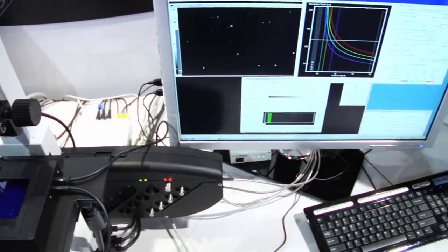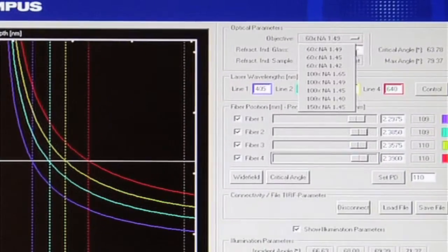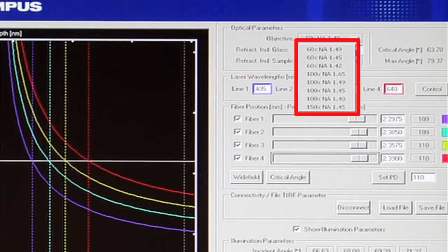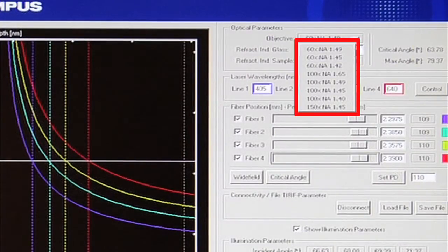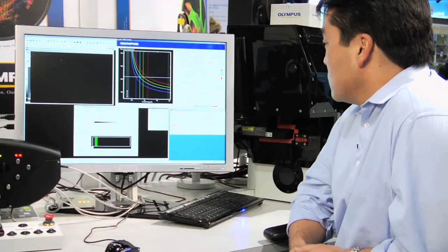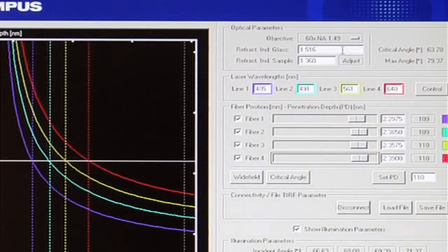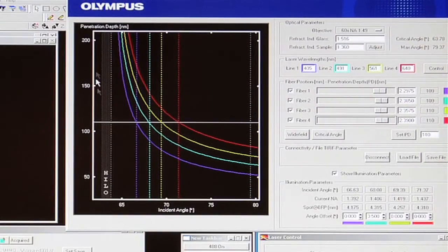Okay. Well, maybe you can just walk us through the control software system. Absolutely. The way that we have this set up is that each of our TIRF objectives are preloaded into the software. So, we now have six TIRF objectives. We have 60x 1.45 and 1.49, 100x 1.45 and 1.49. We have our 100x 1.65 NA objective. And then we also have 150x 1.45. So we have a fantastic range of optics to go with the illuminator. And all of those are preloaded into the software. So you would just go in and select your particular objective. And then the graph on the left hand side is showing incident angle on the lower axis versus calculated penetration depth on the left hand axis.